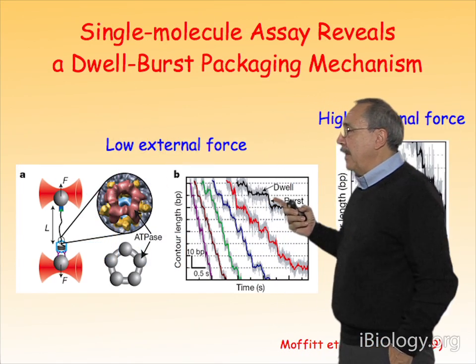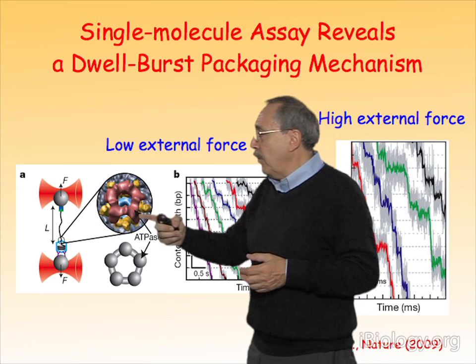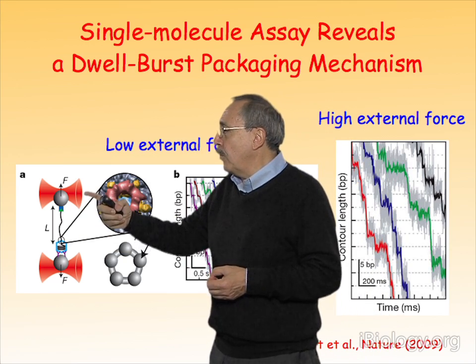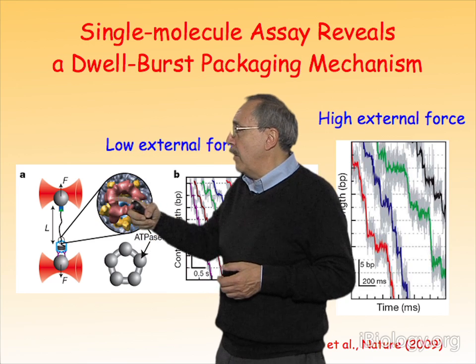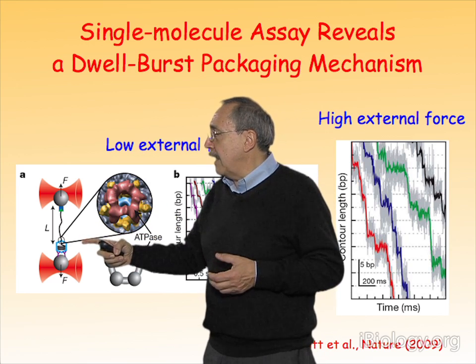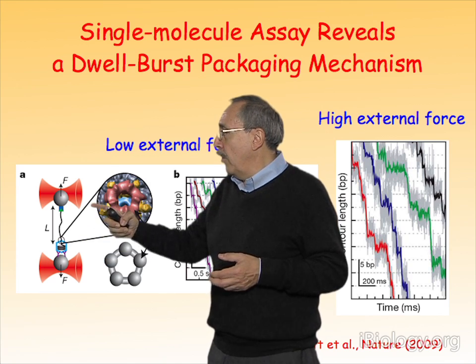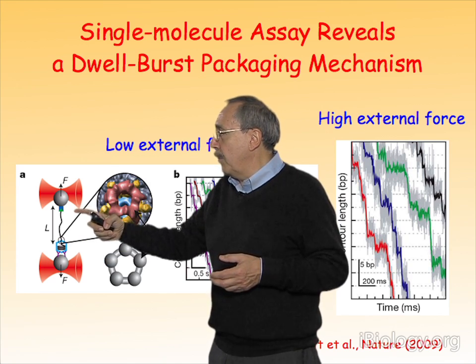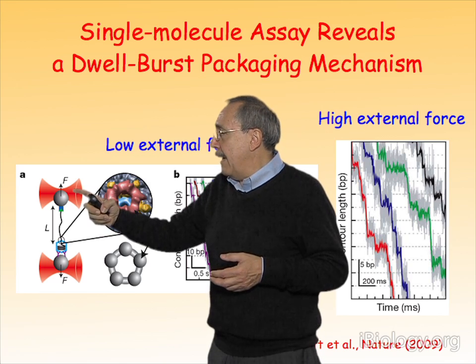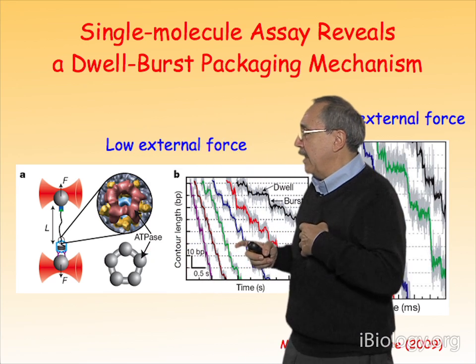And this is one of the things that we observe. We observe that if we apply a small amount of force, of course, the stiffness of the DNA depends on the amount of force applied. In this case, we are using two optical traps. Notice, one optical trap has attached the bacteriophage capsids, and the other optical trap, just as I showed you before, via biotin streptavidin, attaches its bead to the end of the DNA that hasn't yet been packaged.